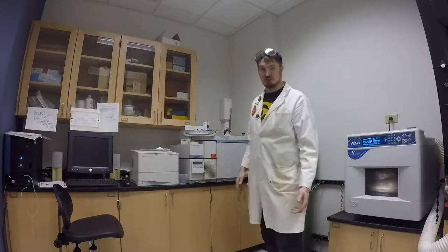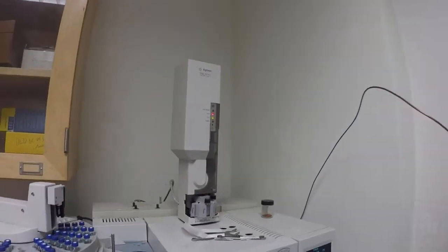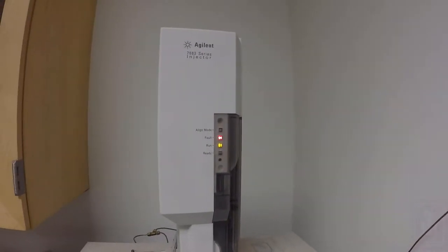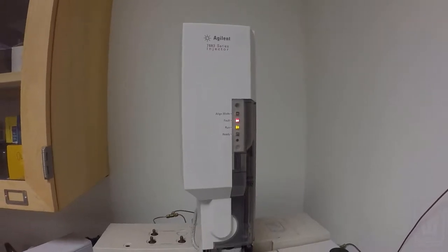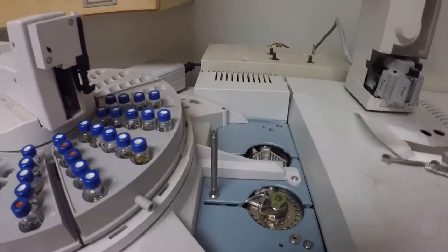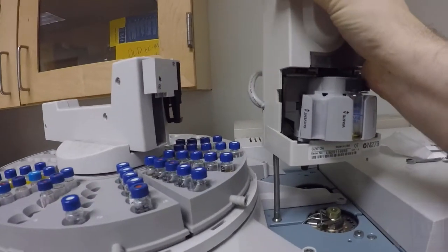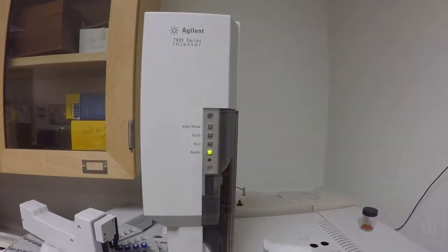The first thing you want to do is to make sure that the GC-MS auto sampler, which is this tower right here, is actually plugged into the injection port. Right now you can see it's having a red fault line, which means it's not prepared, so we need to move it over to stick it onto the turret. So this pin here needs to go into this hole, and so you can set it down and it should click straight down and be seated. You'll also see that it goes to ready.